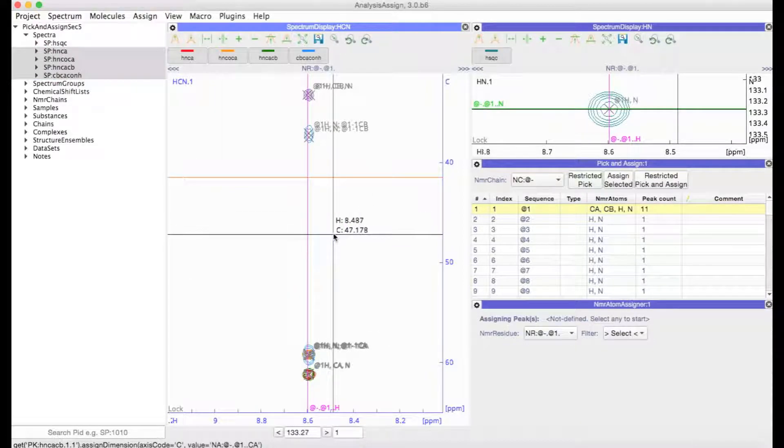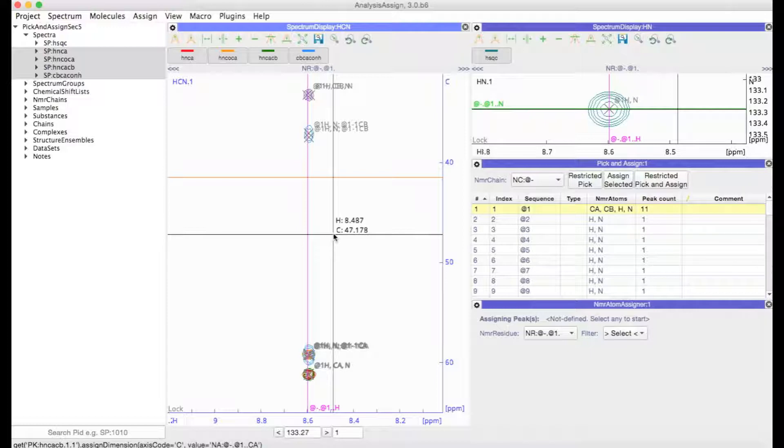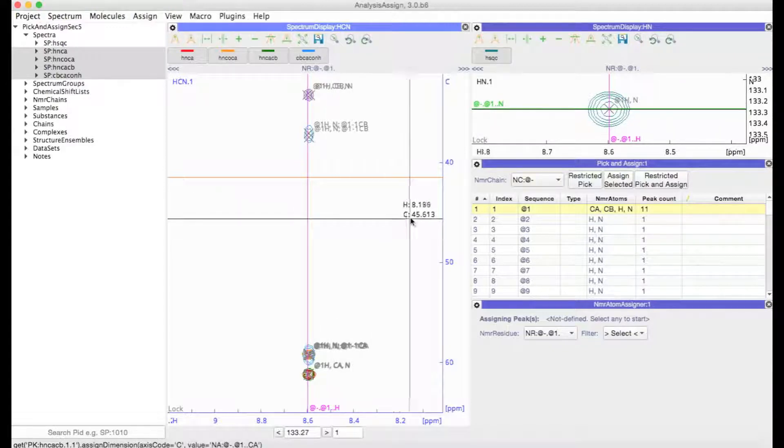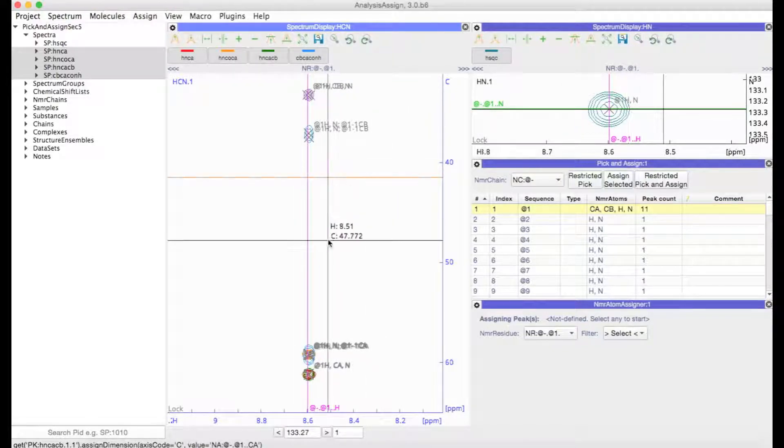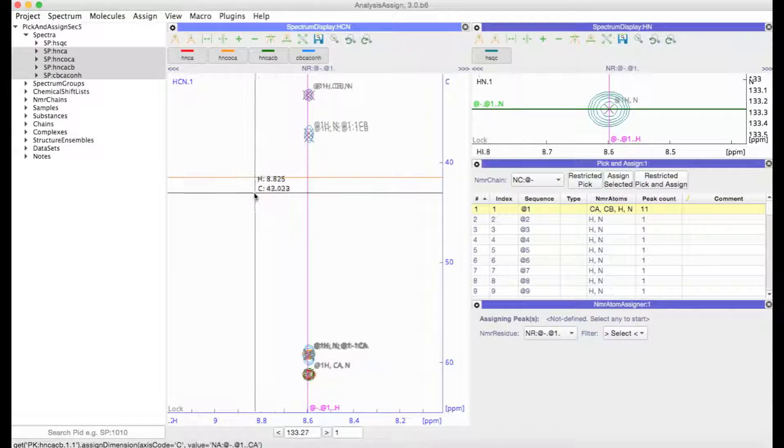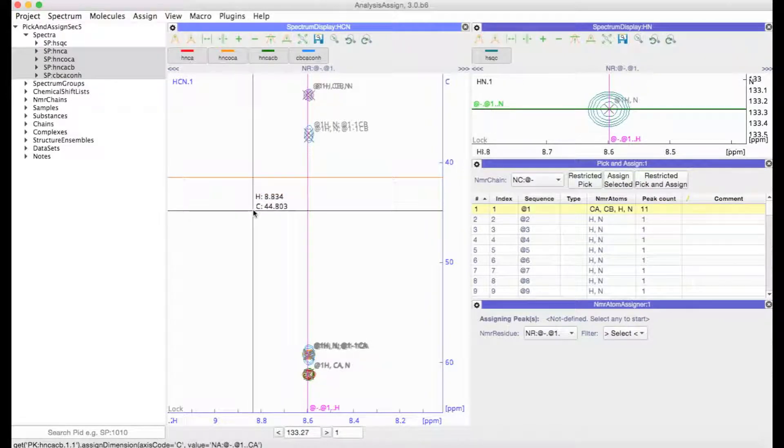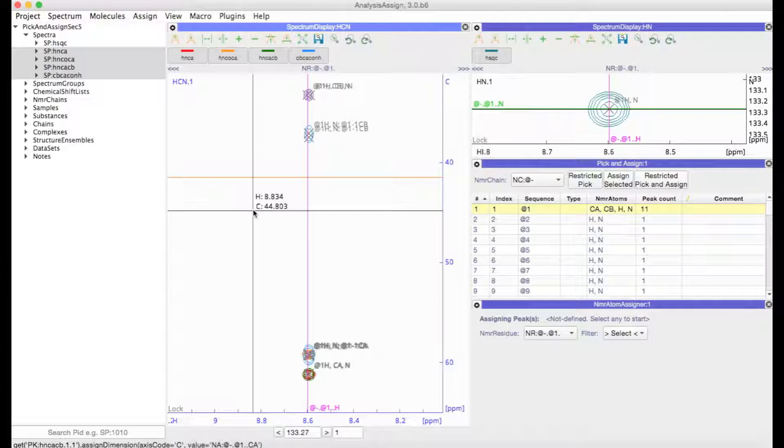Remember that when you are doing your peak picking, the peaks are picked based on the contour levels that are currently visible. So as you go through your strips, you may want to lower or raise your contour levels. It may also be worth switching off the negative contour levels for some of the spectra where you're not expecting to see any negative peaks.